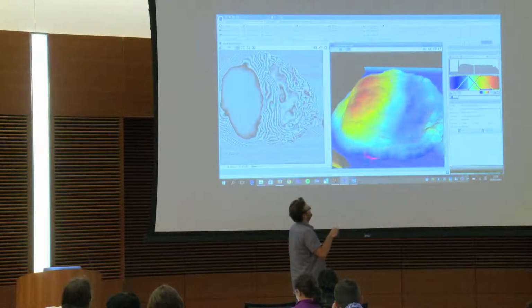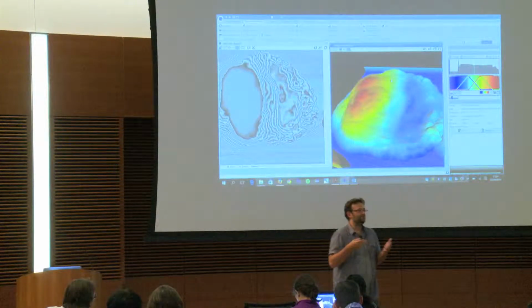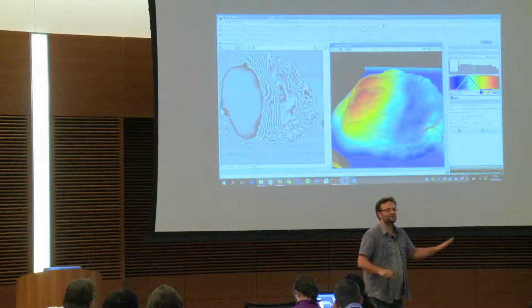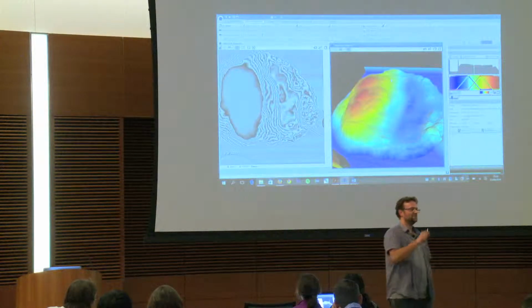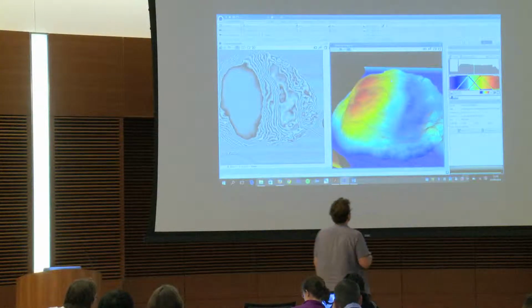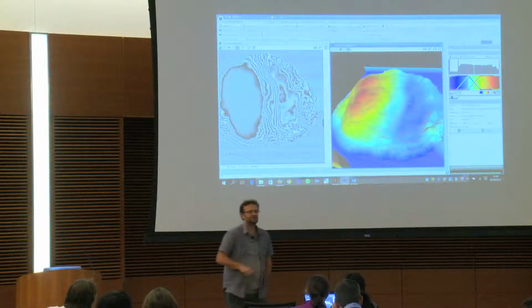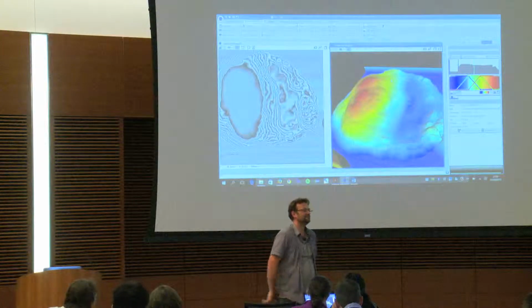Okay, so you have this image here, and if you like it, or if your boss says, okay, go with it, it's cool because we can publish in Nature right now. If this is true, we can publish all together. So you would give me your name at the end, okay? And we have a good one. Because it's not possible. This image is not natural. There is a problem in it. Can you tell me what it is?